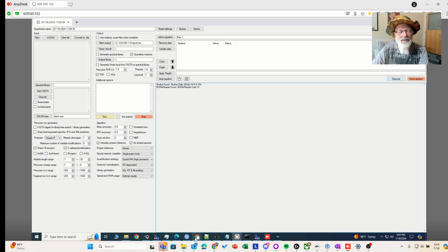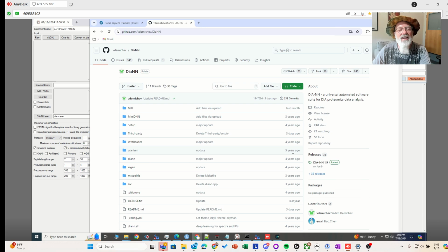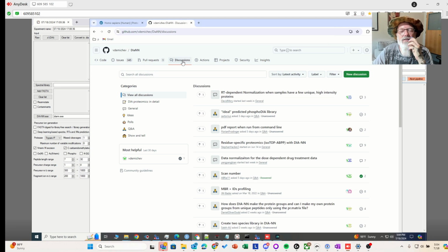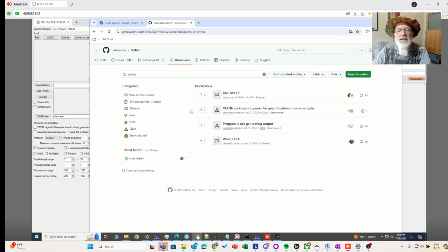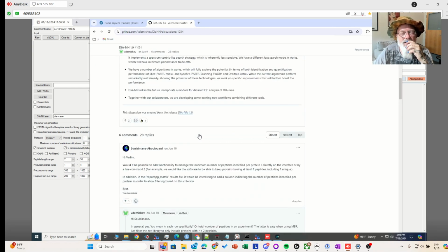Skyline Daily needs to be installed, but there's a little trick to it, and it took me a day or two to figure it out. If you go to the discussion on the GitHub, there are some new versions of DIA-NN.